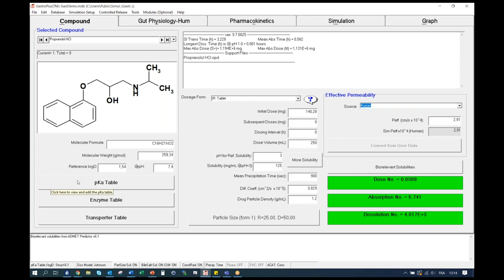This compound tab also integrates information about the dosage form, with the administration schedule containing the initial dose and subsequent doses, if any. And finally, this tab also includes the intestinal permeability value on the right that is used during the simulation. However, GastroPlus also integrates multiple other options for dissolution absorption model settings, and those will be discussed in subsequent videos.